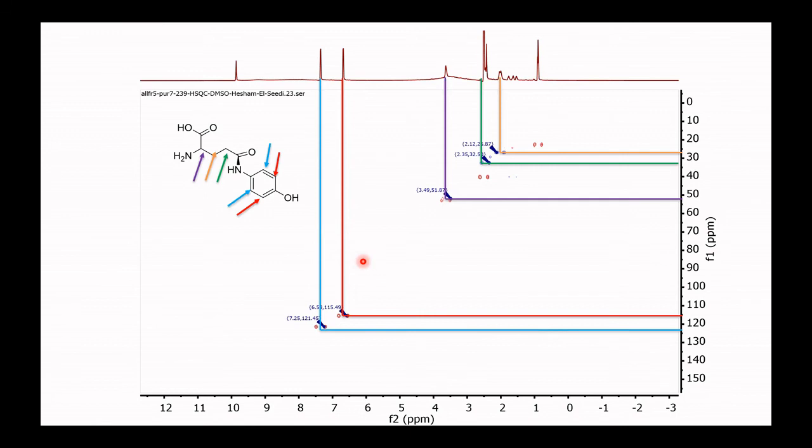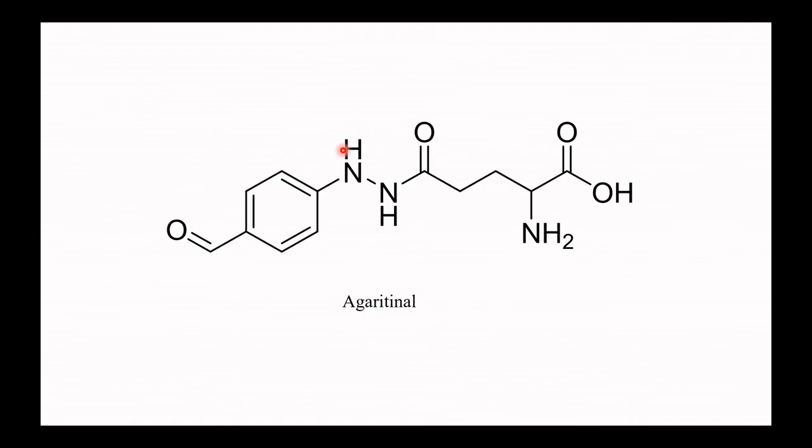So now you can practice more and more, not only of the chemical shift, but also about the correlation spectroscopy. I think you agree with me that NMR is easy. It just needs that you practice with many, many examples. And by the end of this lecture, I will leave you with some examples so you can stop the computer and practice by yourself.